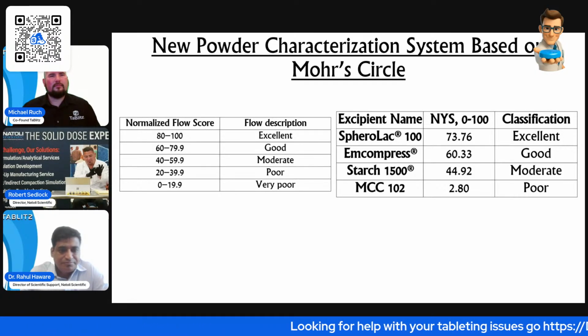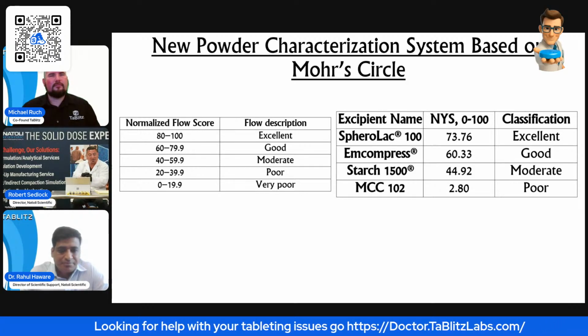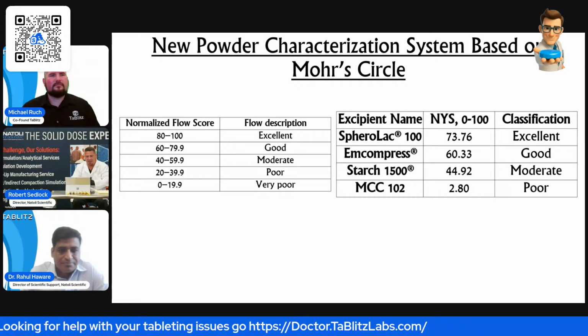We make them out of these, basically the steel discs that go in the bottom of your powder rheometer, and then we can run the machine and we get the sticking index. So yeah, we look forward to that.